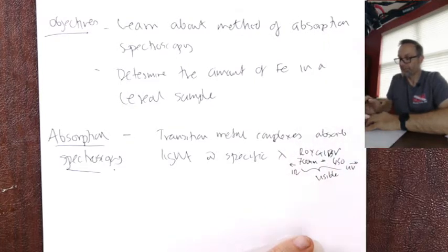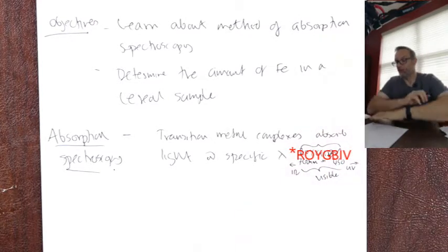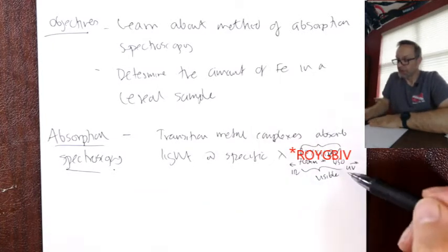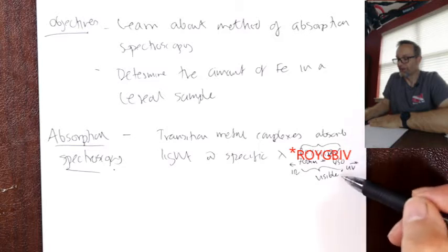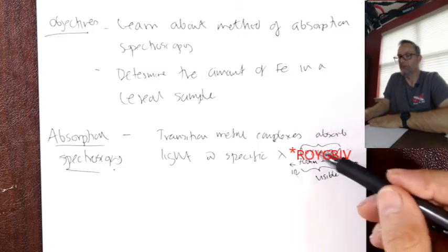Sorry, blue, violet. Okay, all right. So those are the colors in the visible spectrum between about 650 to 700 and about 450 nanometers. The shorter wavelength is the ultraviolet or violet end, the long wavelength is the red moving into infrared.